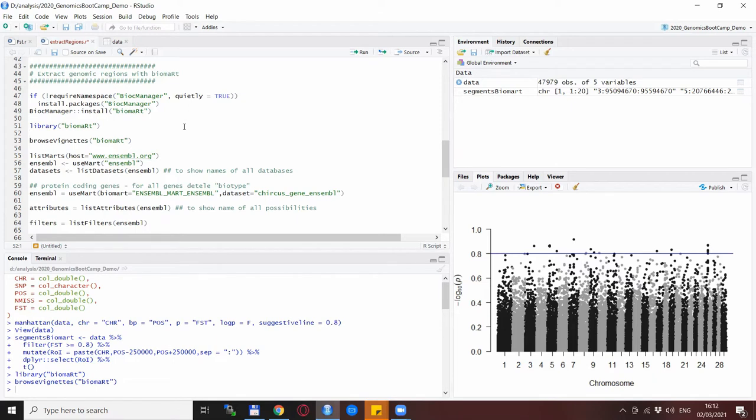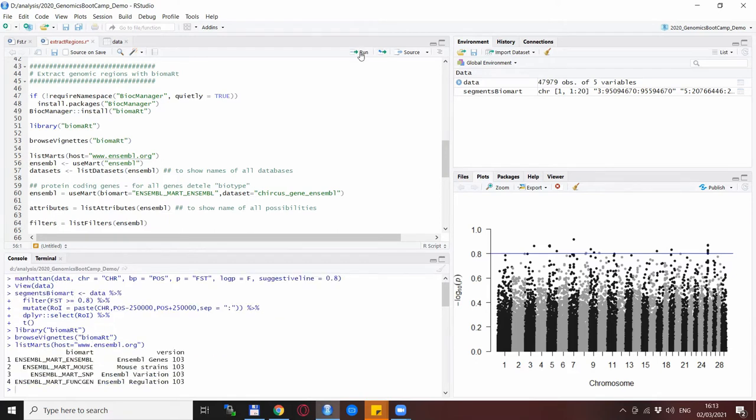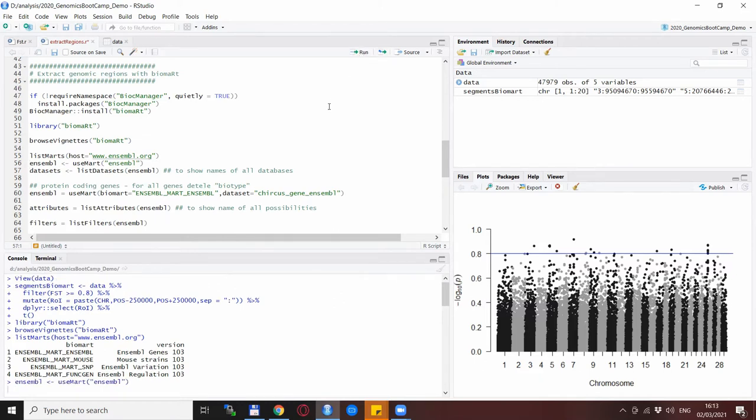There are several steps that need to be taken before you get to the extraction of the genomic regions. The first step is select a host and in this case we select the Ensembl website or the Ensembl database so you do that and then also with this useMart option you select the Ensembl database.